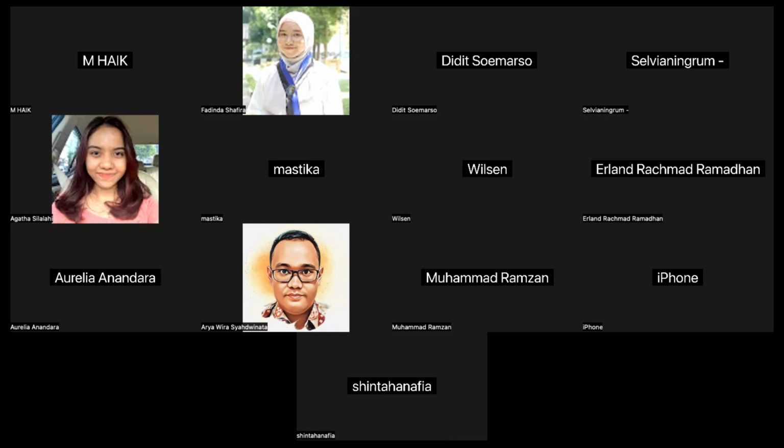So for the key notes about today's lesson, the first one is we already know how to run the public workflow and run the existing workflow, and it will save a lot of time because we can reproduce it and rerun it with different kinds of samples. And second of all, we can search for the publication in Galaxy and search for related items in the public servers for the nanopore in the Nano Galaxy. And the third one is we learn how to reproduce the nano tools in Galaxy in the topic about microbiome in bio data analysis.